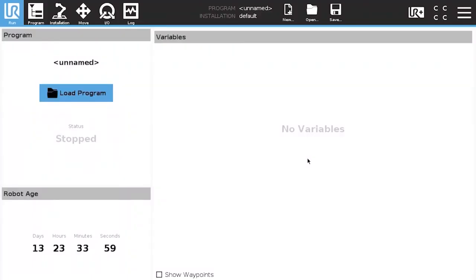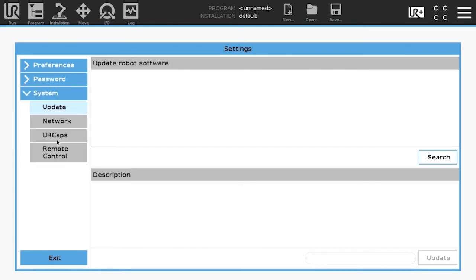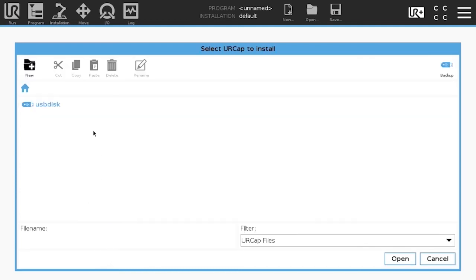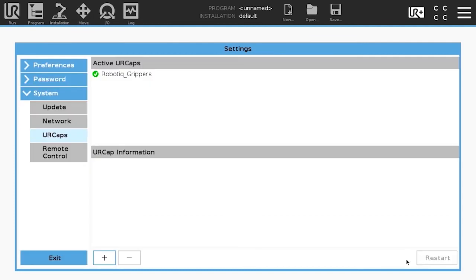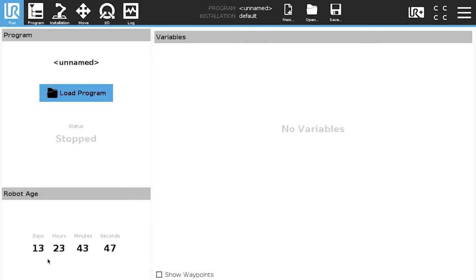In order to install the UR cap, tap the triple bar icon and select Settings. In the navigation pane on the left, tap System and UR caps. Tap the plus button and select the corresponding USB drive. Tap the UR cap you wish to install and tap the Open button. Restart the robot software to complete the installation. From this point on, the USB storage device will not be visible in the user interface, to prevent altering the files of the Vision System.